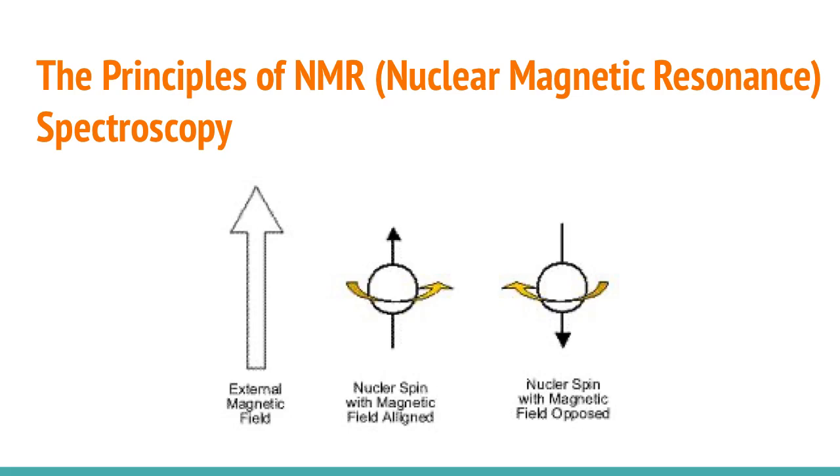In this video, we are going to explore NMR spectroscopy, or nuclear magnetic resonance spectroscopy. In order to understand what NMR spectroscopy is, we first need to understand that some nuclei of atoms, some examples are protons, C13, F19, and 31 phosphorus, have this property that's called spin.